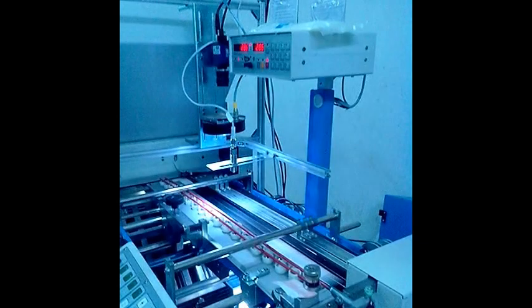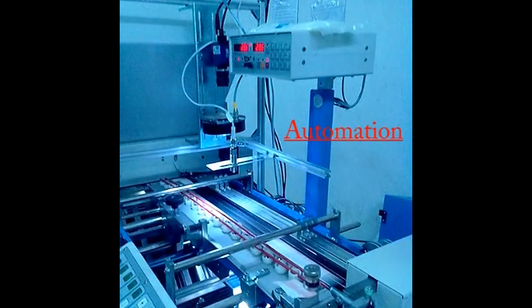The defective labels can be removed either manually by triggering the machine to stop or through an automated rejection system.